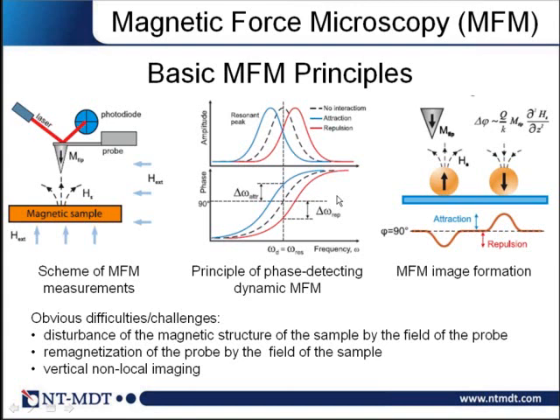Well, the question is, do you need special probes for vacuum measurements, or are the standard probes appropriate? As far as I understand, you don't need special probes for vacuum measurements. You just use the standard ones, and you increase the quality of your picture with the same probe just for free, just by pumping your system out.